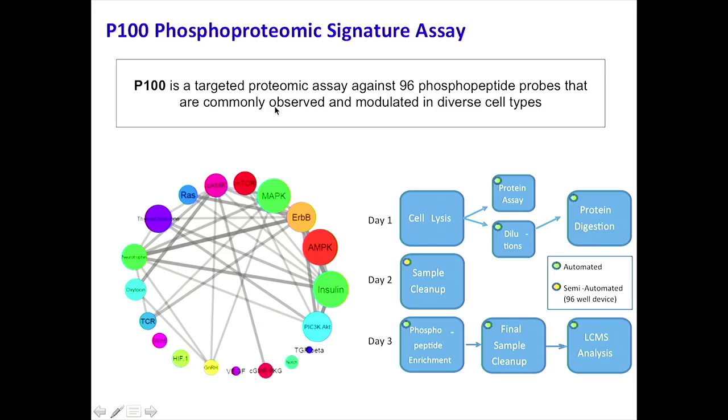And so we actually filtered out those kinds of phosphosites that did not change across many different drug perturbations. And what we're left with is something that we think will be a good readout of chemical or genetic manipulations of cells in general. But if we look back at the source data from which these phosphosites were drawn, not just the probes, but the entire set, we can show that they're mapped onto various pathways that are of biological note or biological importance.